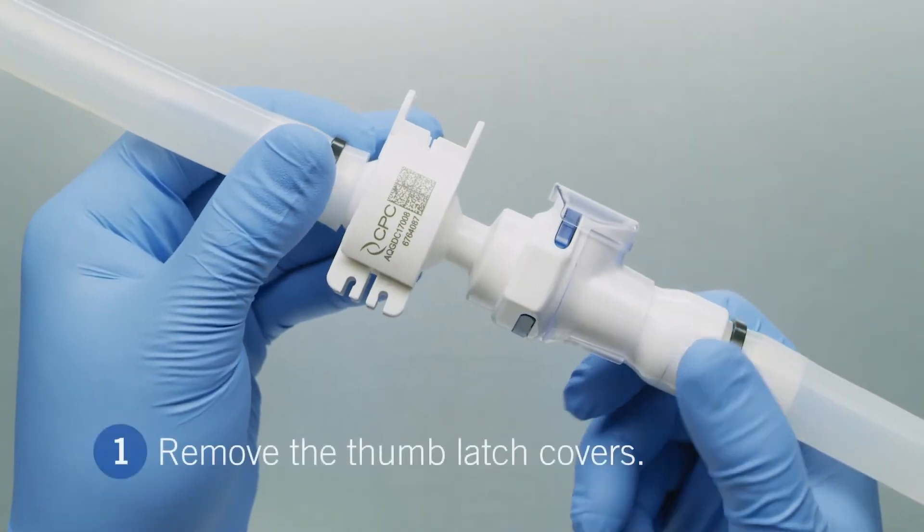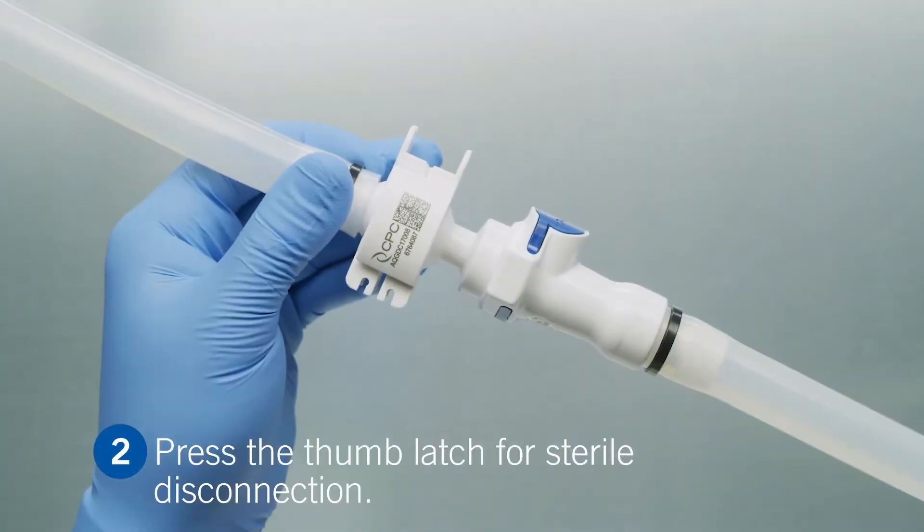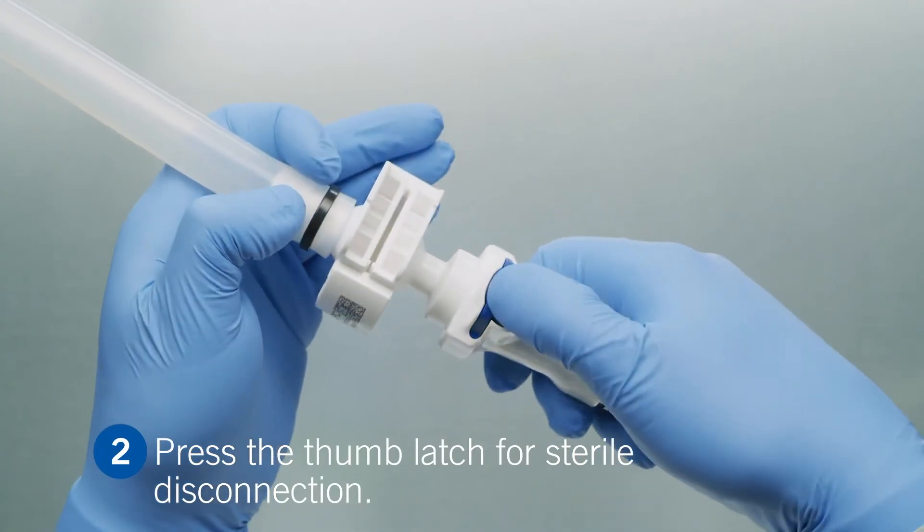First, remove the protective thumb latch cover. Then, press the thumb latch for a complete sterile disconnection.